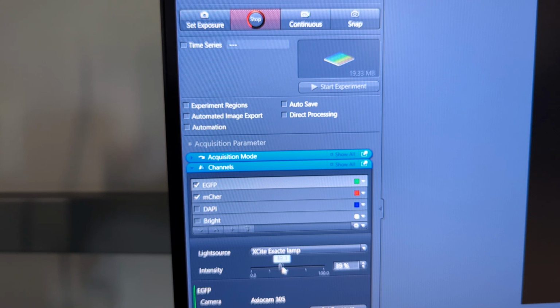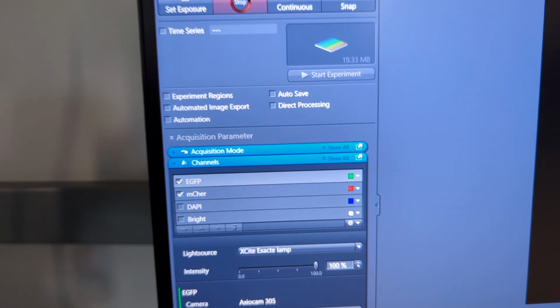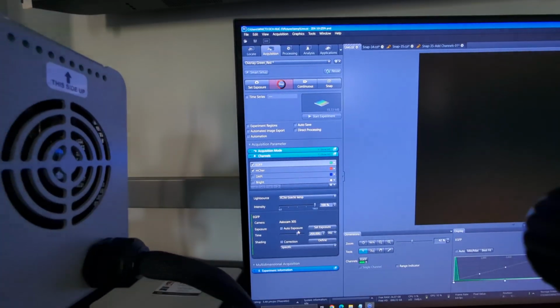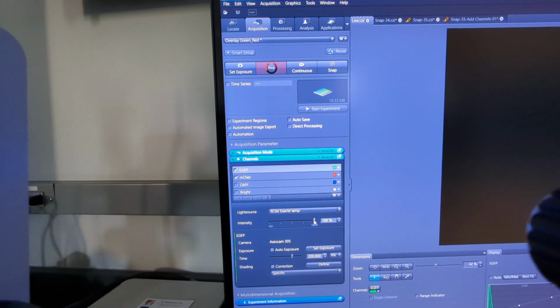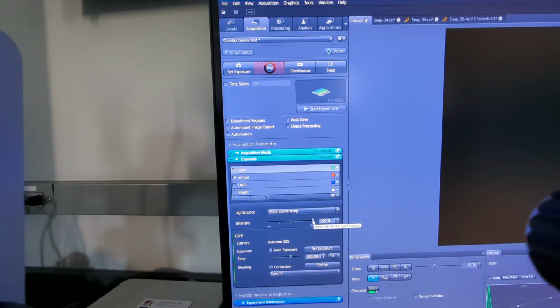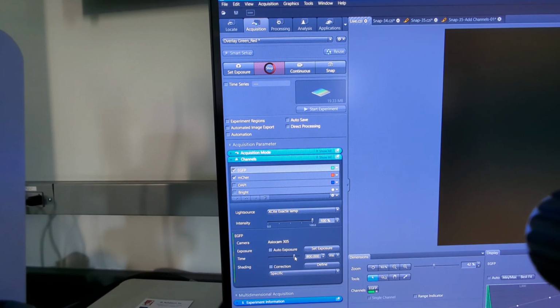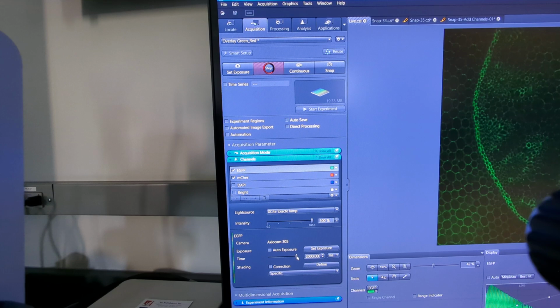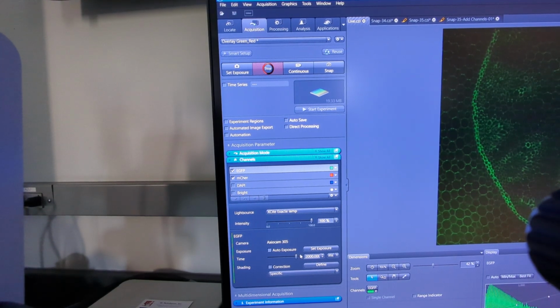And what I'm gonna do is turn this all the way back up again. And then I'm gonna go to the exposure. Oh, hopefully you can see this, I'm sorry. I gotta angle it down more. Or here, I'll just do this. Okay, so, sorry, I was turning the intensity of the lamp house up, where you can use the controller as well, and then go to the exposure until you can see what you need to see for your GFP. There it is.